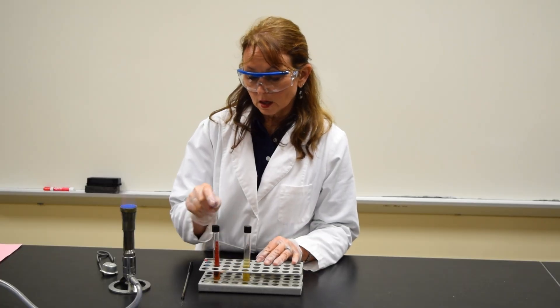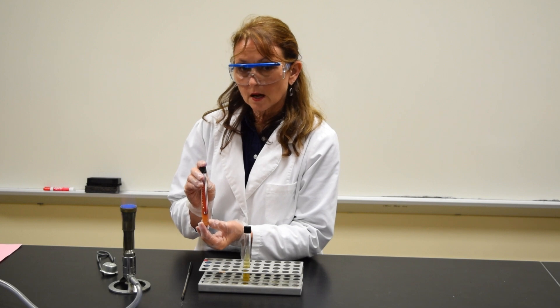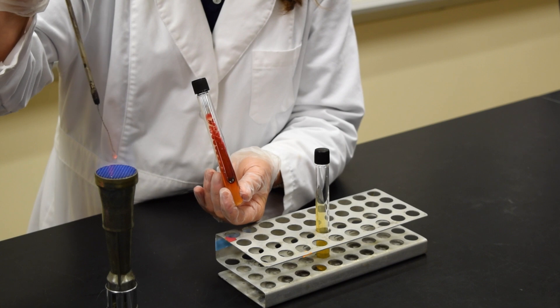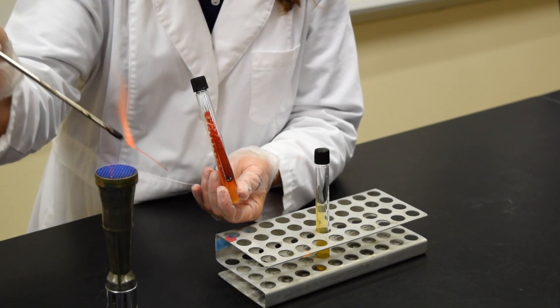I'm going to be inoculating the slant with bacteria that I have in another slant. To do so, take your inoculating loop and sterilize the loop, the wire, and the bottom of the handle.